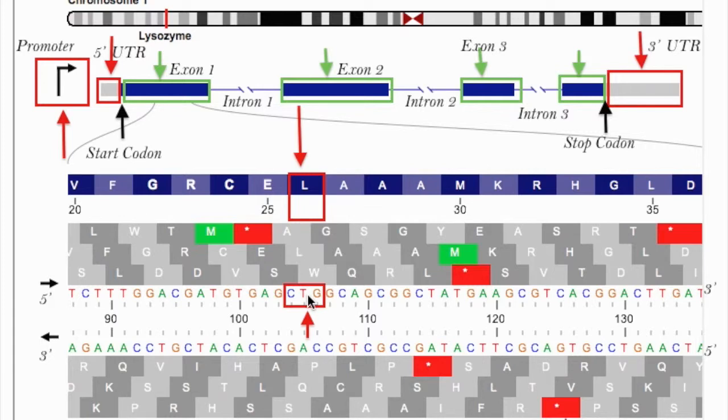If you look up in the codon table, you see that CUG is Leu, as you expect. The reading frame stays the same in each exon, but it may change when going across an intron. So we have leucine in the protein sequence. When you come down here to the DNA, you see CTG, but in the mRNA it becomes CUG.